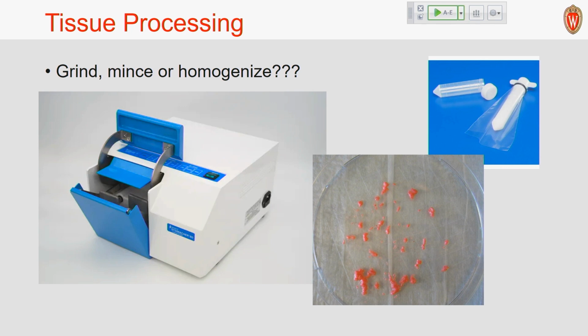But even for routine cultures, we can grind, homogenize, or mince. I think a lot of larger labs use a homogenizer. It's very nice. It's a little bit expensive. I don't know if they're built like this anymore, but we've got one of these stomachers that has been around since the dinosaurs roamed. It never breaks. We have several of them. They just work and work and work.